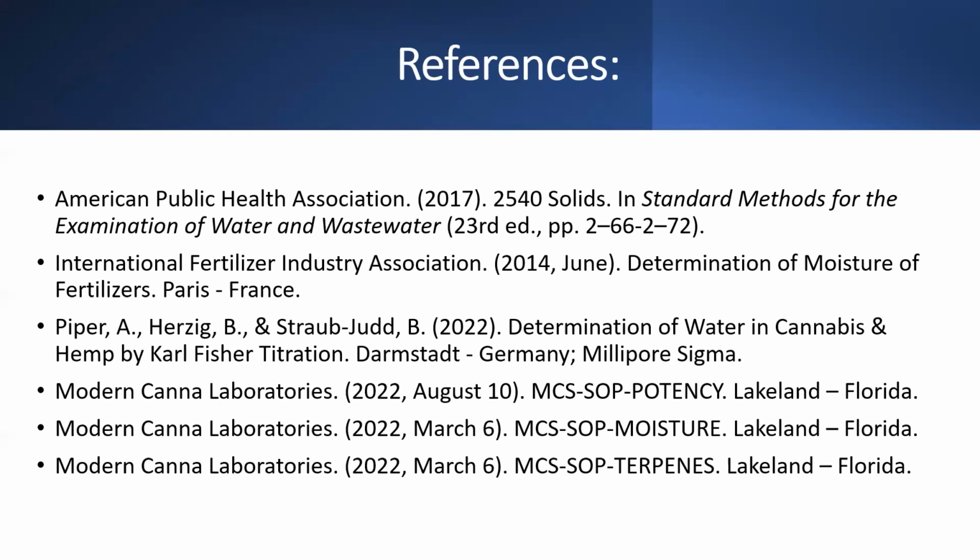I hope so. I hope that, through this presentation and through the study that we did here, we'll be able to get a little bit more exposure for vacuum desiccation methods versus the loss on drying methods, so that we can begin questioning how moistures are being obtained and why moistures are being obtained the way they are. And part of what I'm doing is, in hopes of creating these standard methods, working with organizations like AOAC. What we're doing internally, we've spent a lot of time working on, and I think that it is truly more accurate than a moisture balance. And so I ultimately hope that it can be adopted as a standard method.